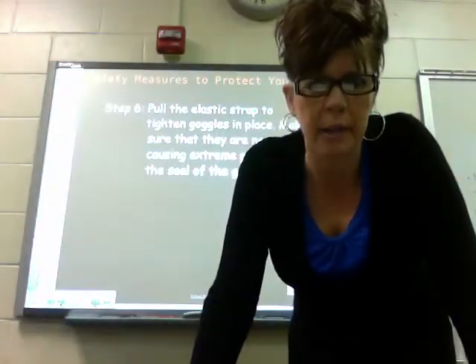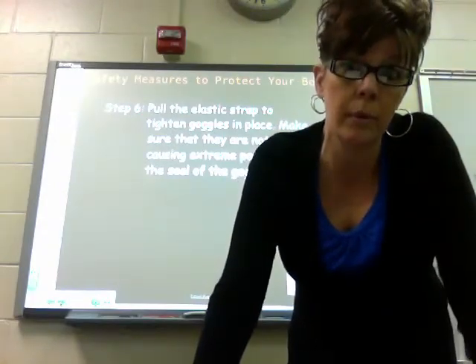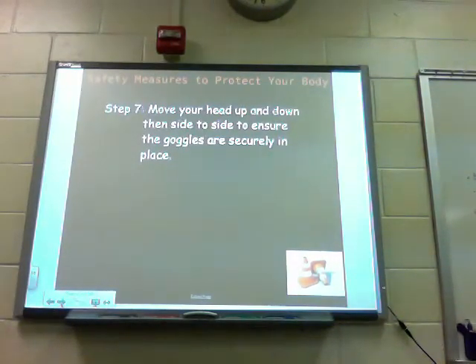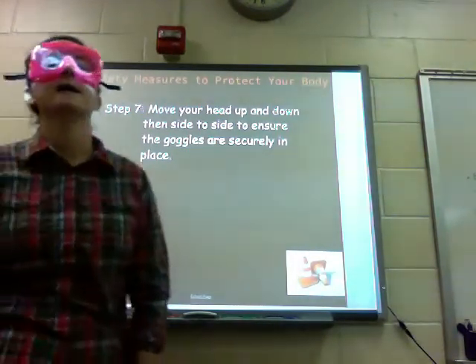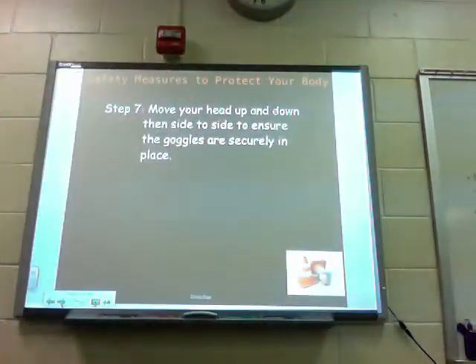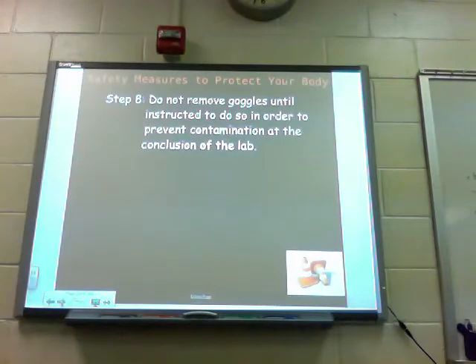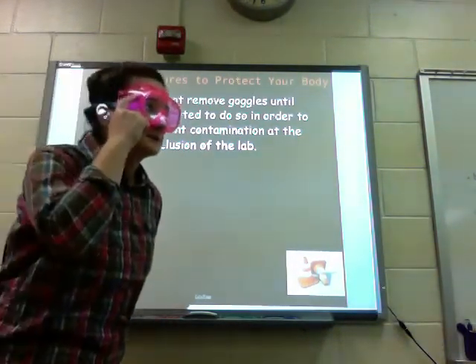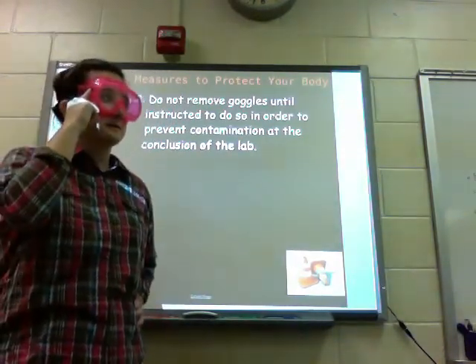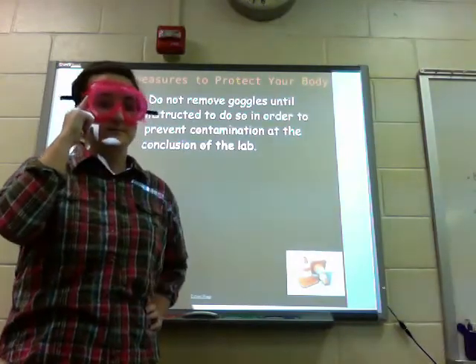We do want to tell you that we expect your goggles to be somewhat uncomfortable but not cause you extreme pain. Step seven: move your head up and down, then side to side to ensure that the goggles are securely in place — notice they do not fall off. Step eight: do not remove the goggles until instructed to do so in order to prevent contamination at the conclusion of the lab. If your eye itches, you cannot take your goggles off during the lab. If you have to do something, you'll have to go outside of the lab, fix it, and then come back in, but do not leave without permission.